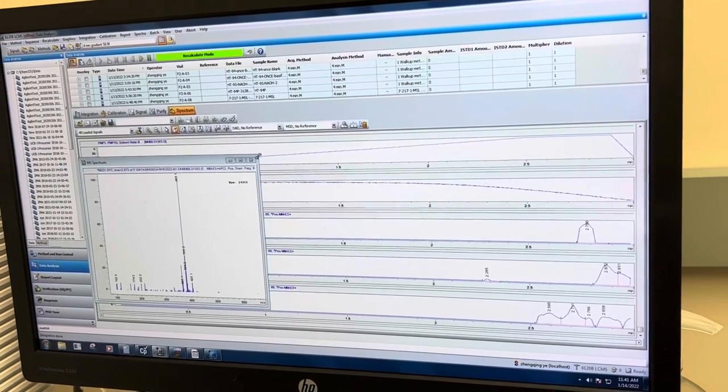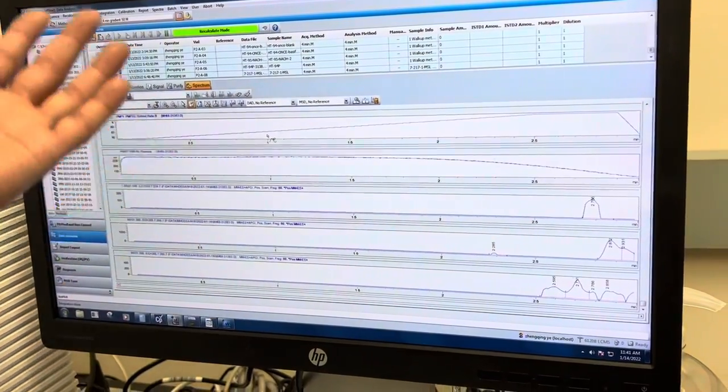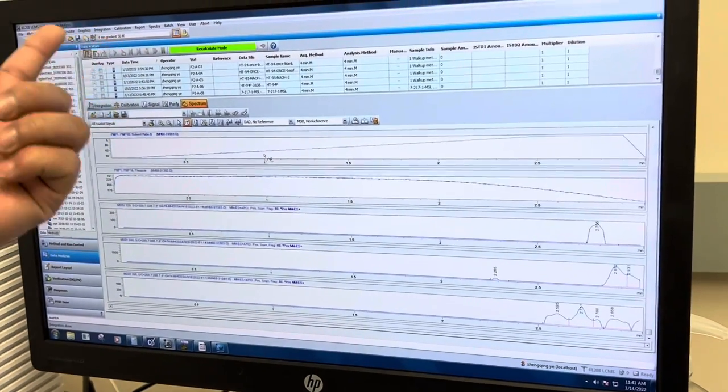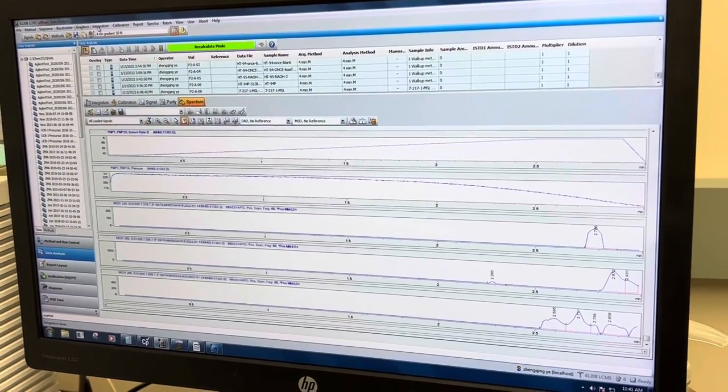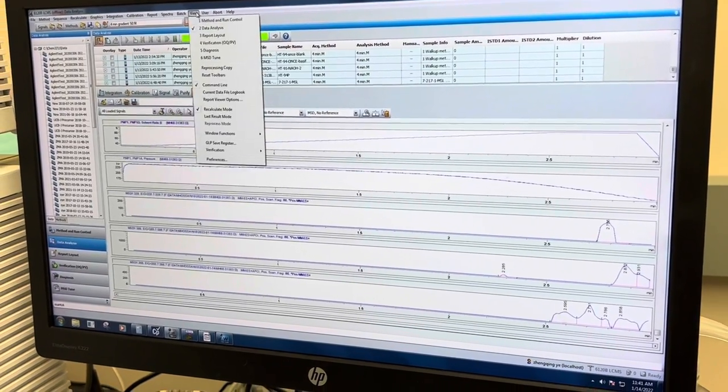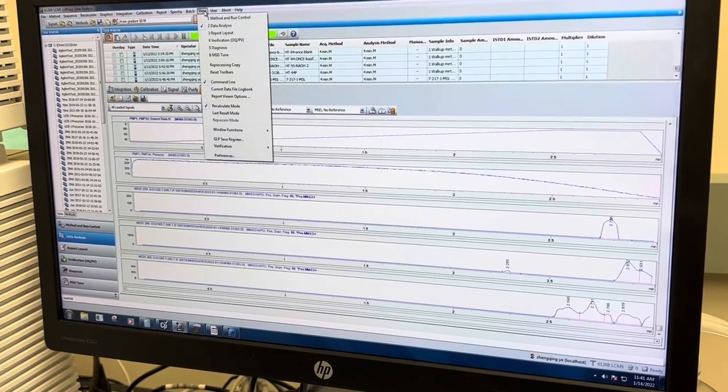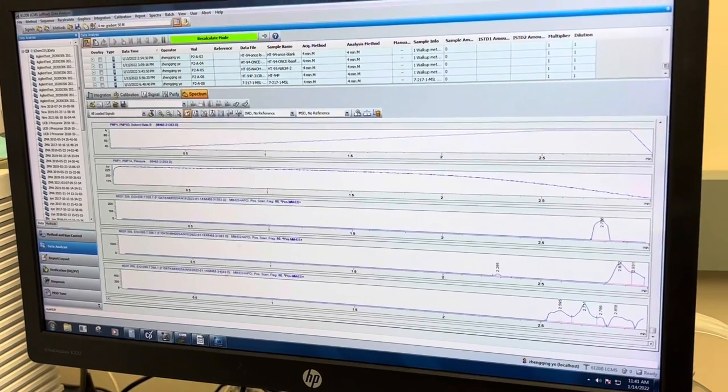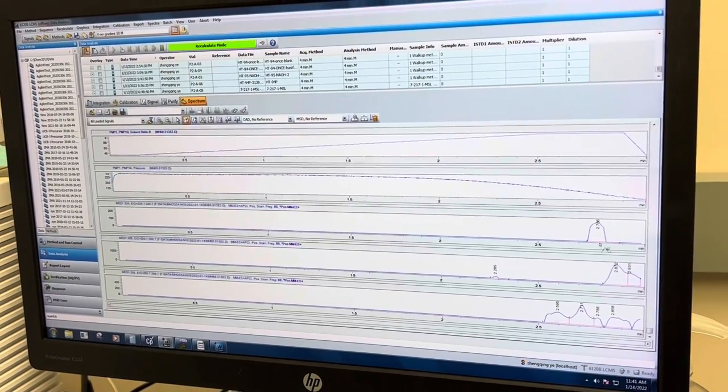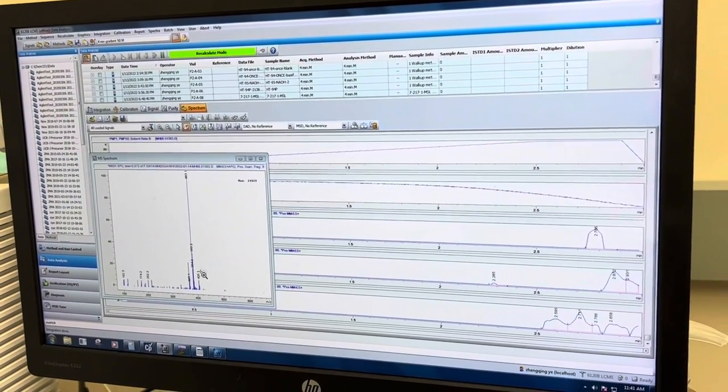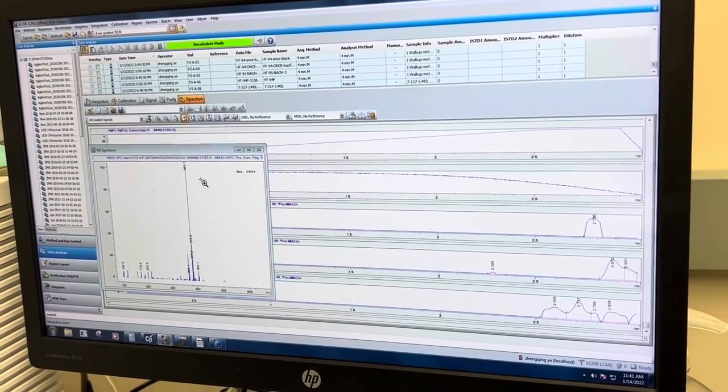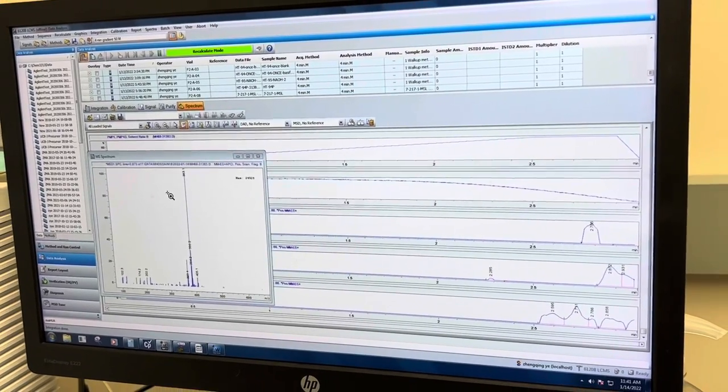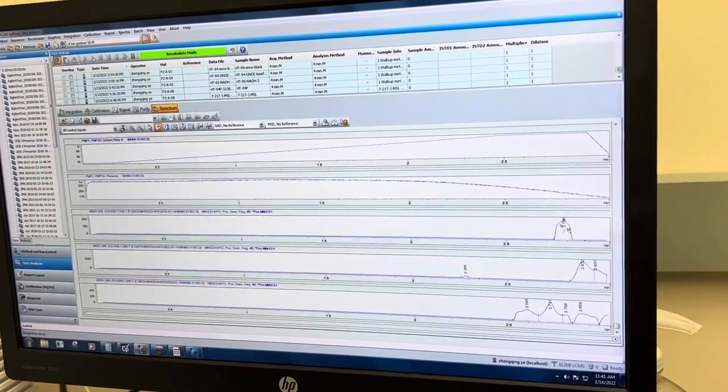Okay, yep, so that's it like then you can make the data analysis by like making report or something from here, you know, like the spectra. So you have to go through all those things. You shouldn't change anything because it is made for everyone. Normally people just check the mass like with the peak in terms of the peak. Click on that then you'll get the 100% peak that is like mostly the mass you're expecting, okay.